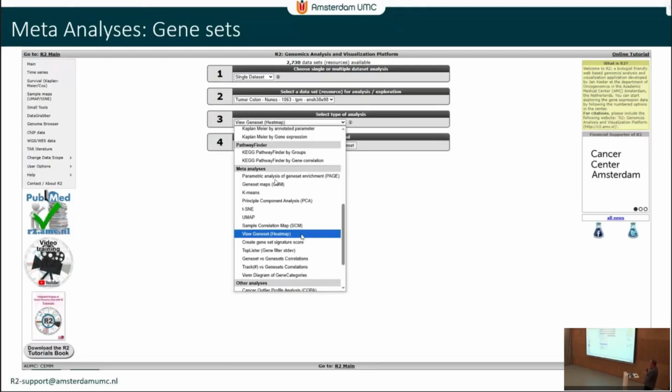So for the proportional hazard, how do you make sure that the assumptions of the test are tested? Not all data is fitted for a proportional hazard test. Yeah, so here we made the assumption that since we're working in log space of the gene expression data, that's a sufficient parameter.